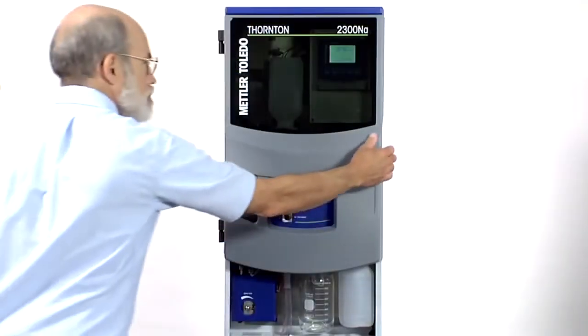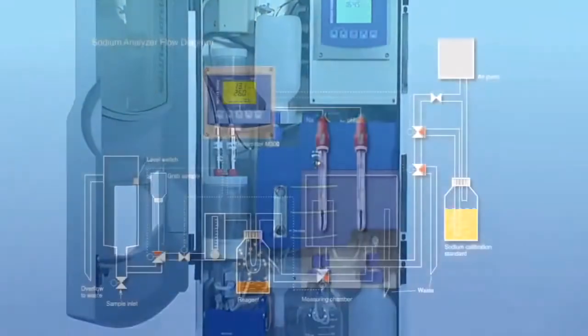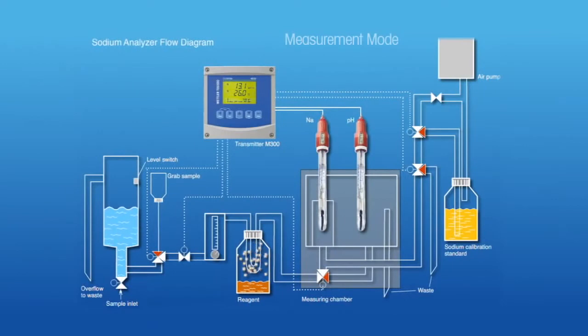Let's take a look inside this analyzer, following the sample flow path. The sample enters and fills a constant head chamber that stabilizes the pressure and flow through the rest of the analyzer.